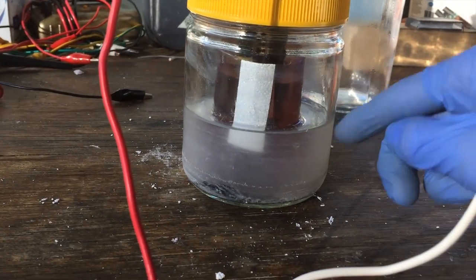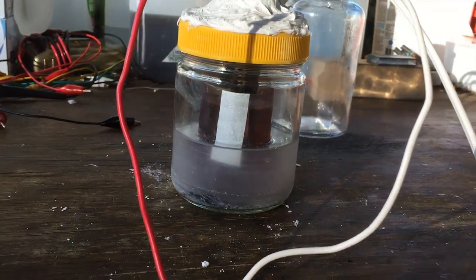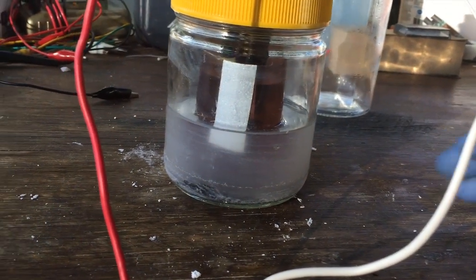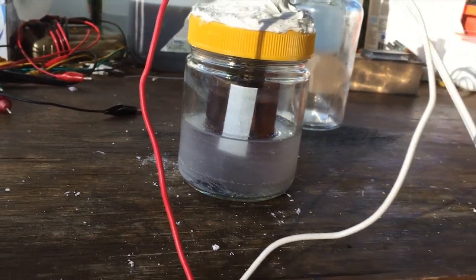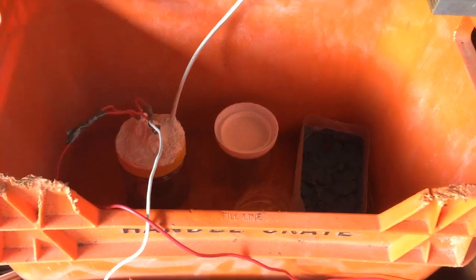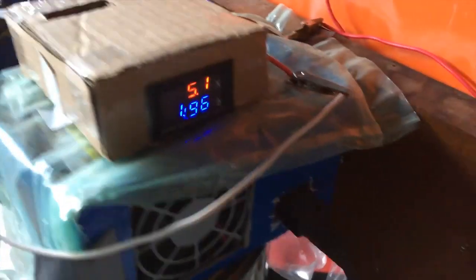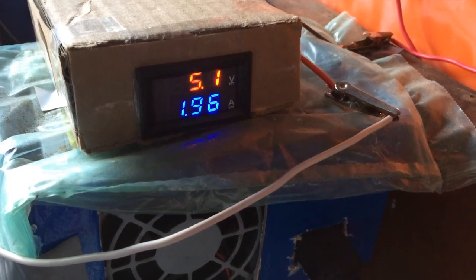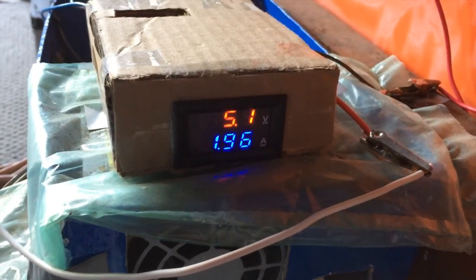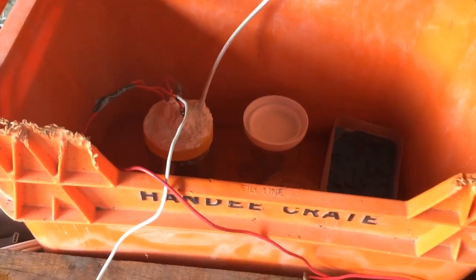I've left the rest of the water outside the inner container just to keep that inner cell cool — because with a smaller volume it's going to heat up quite a bit quicker, and we want that thermal conductivity from the cool water bath around it. It seems to be electrolyzing away nicely — we've got around 2 amps at a little bit over 5 volts, and that's really good because before we were getting 2 amps at like 6.5 volts. That just proves how much better it is to increase the surface area of the electrodes.